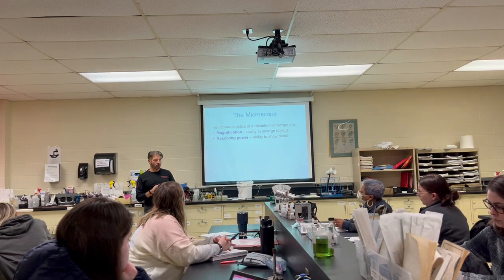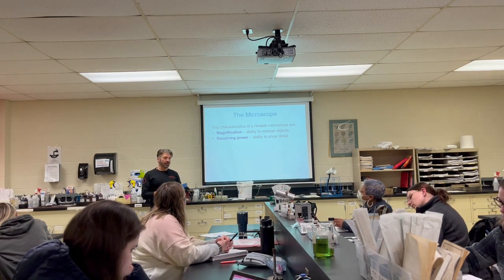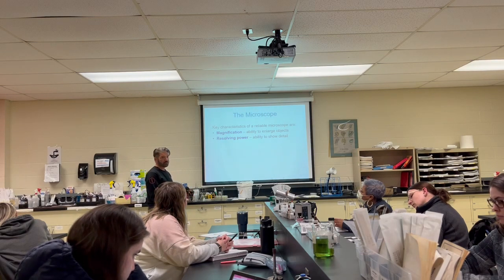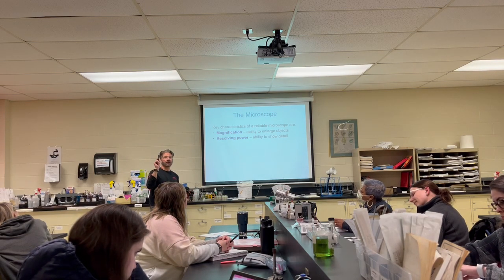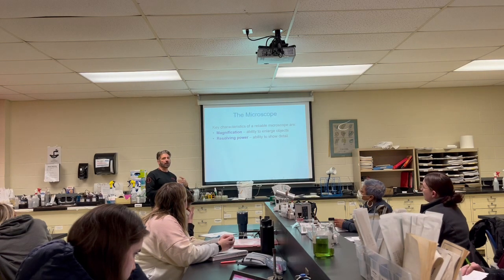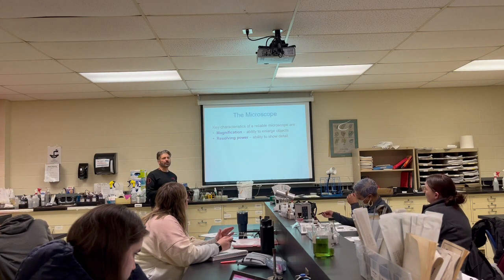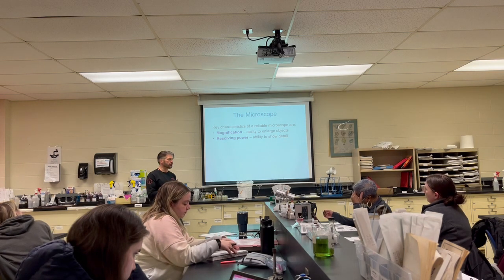So when I went to Kenmore West back in 1981, 10 times 100 was 1,000. There are some microscopes that have a 20x ocular, so they could potentially be 2,000. For here, it's gonna be a basic light microscope, that's all we use, and we're gonna be using oil immersion for bacteria only. In lab, if you're looking at plants or whatever, you really don't need to go into oil immersion. You want oil immersion to give you the most magnification.